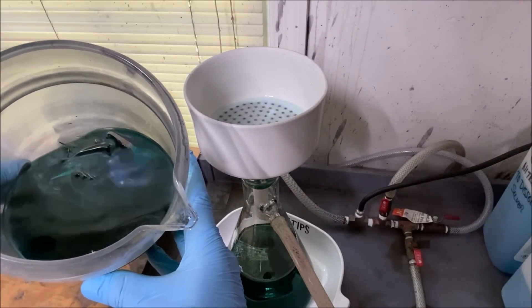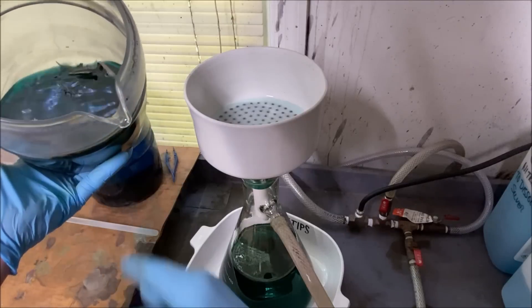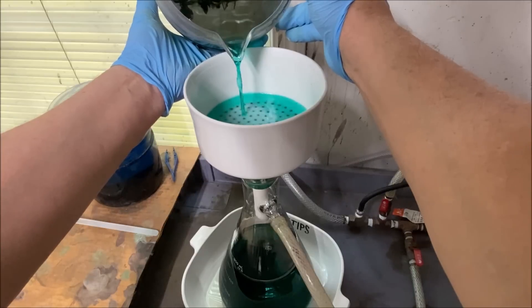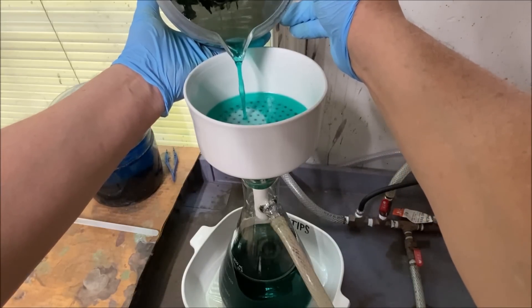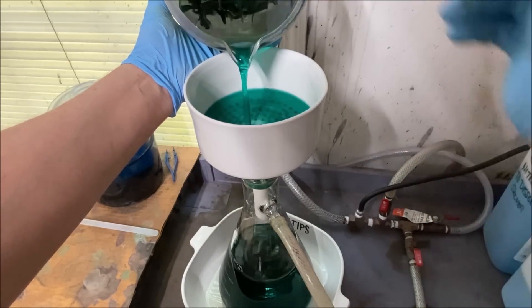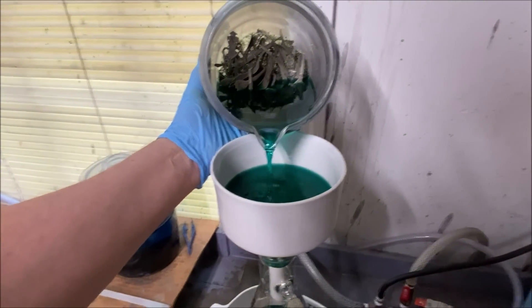If you look down in the filter flask you can see I've got some undissolved pieces of sterling silver in there still. We want to see that because it means we've consumed just about every bit of excess nitric that could be in that solution.